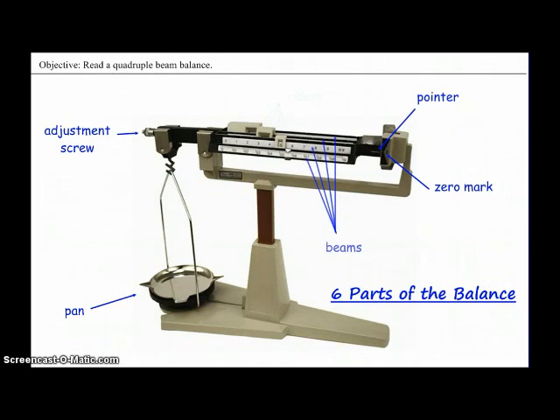We have four beams on the quadruple beam balance, and each of the beams has its own riders. The riders are adjusted in order to find the mass of the object.